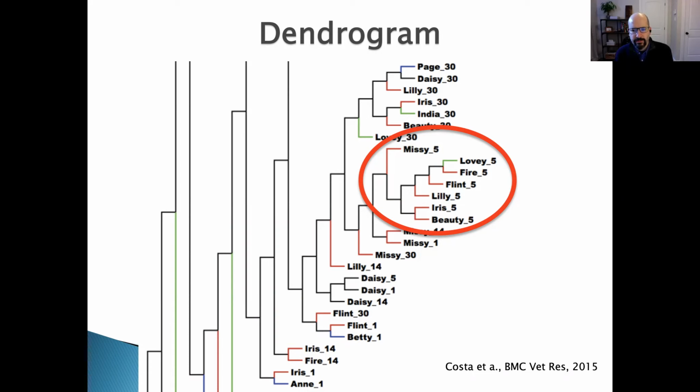And the other question that came up was if the dendrogram and the PCOA will normally agree.